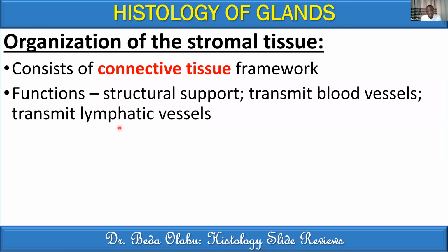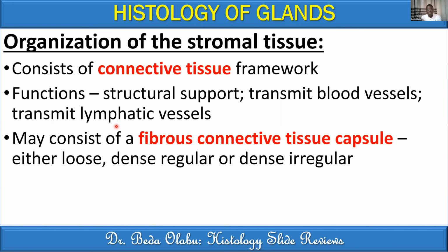Also within that supporting framework, we have lymphatic channels, and different glands may have different amounts of lymphatic vessels. But generally, in principle, the connective tissue elements carry lymphatic vessels as well. Now, that is with regard to the functions of the stromal tissue.